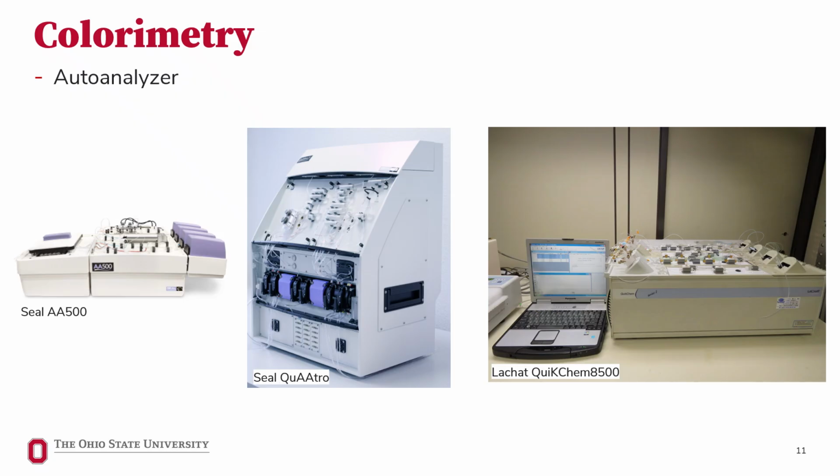However, it is important that the technician who operates these machines understands the chemical processes for analyzing nutrients, which is why we're doing this analysis by hand in class. The technician needs to be able to troubleshoot any issues with the machine, as well as make reagents and standards. The technician needs to be able to interpret the results by understanding a standard curve and perform quality control measurements on the samples run by these machines.